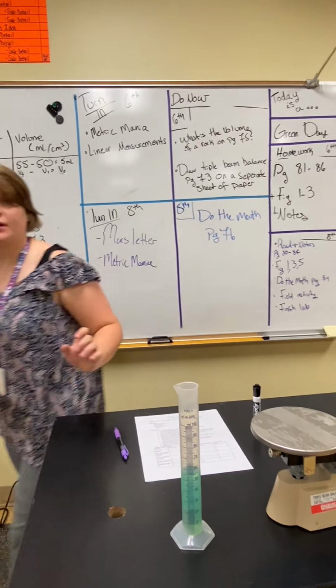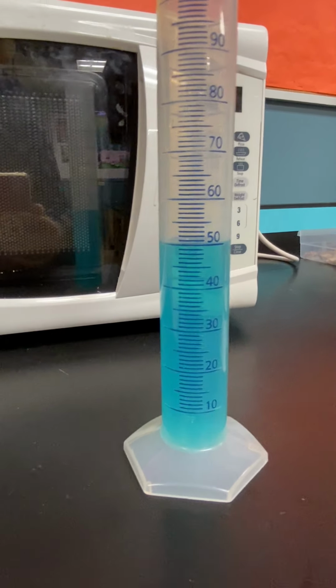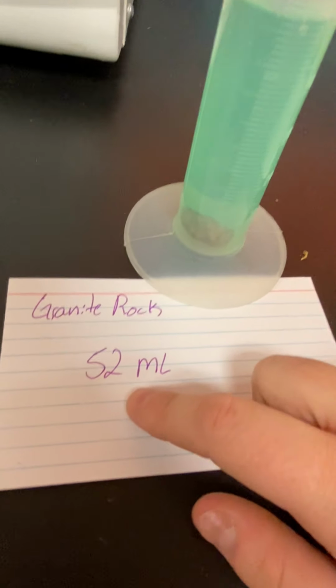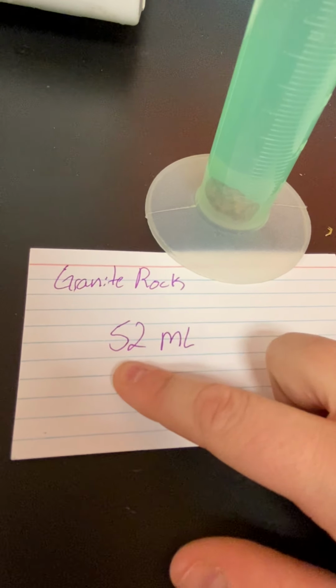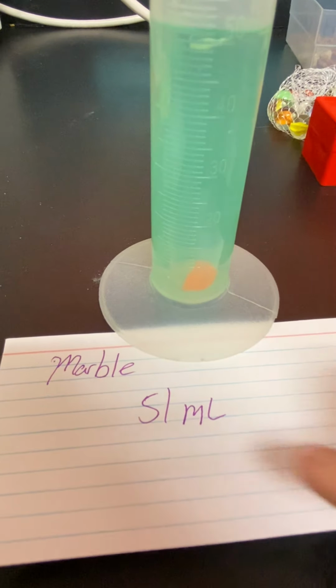So, now, if you come over here, you can always see that my initial volume is a volume of 50. That is what we are, 50, all right? Now, because these graduated cylinders, the ticks right here are really clear, I wrote down the new volume, the final volume. So the final volume of a granite rock is 52 milliliters. All right, same thing for here. I filled it up with water, I put the marble in. So the final volume of the water is 51 milliliters.